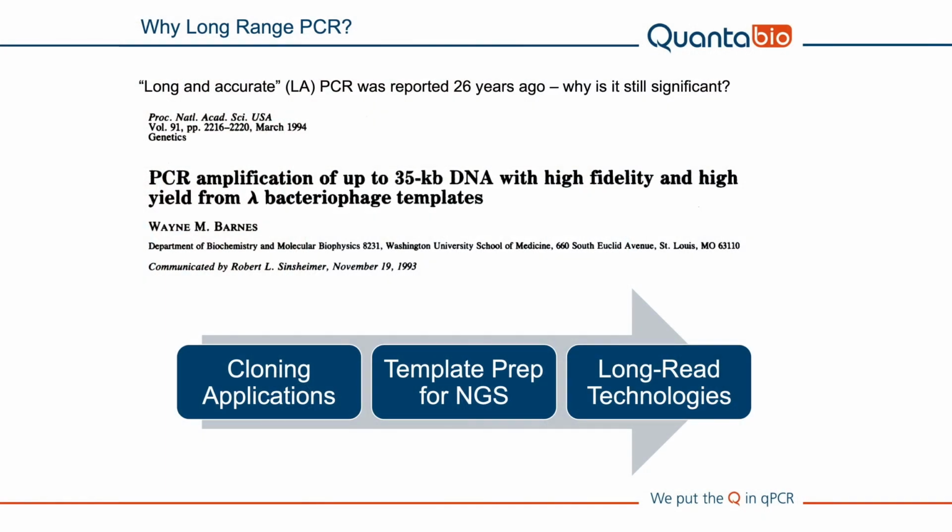and some of these have been around for a very long time. So you might ask, why long-range PCR? I mean, this is 26 years old now. I met Wayne Barnes back when he first did this. It dates me, but some of this technology could actually be older than some of you sitting in the audience right now.